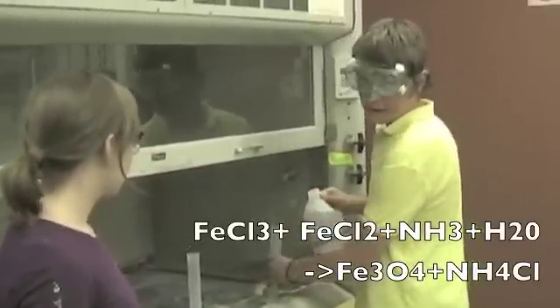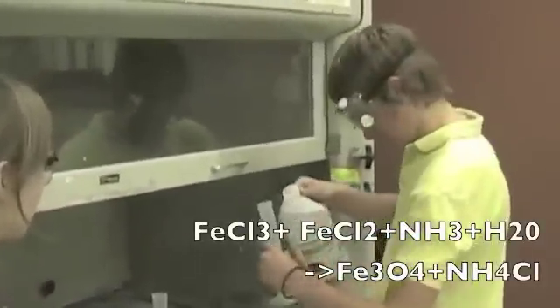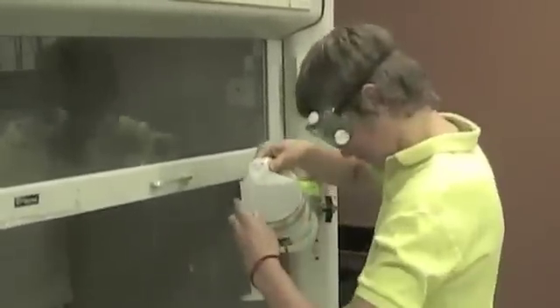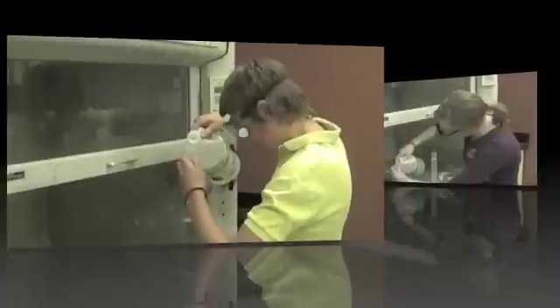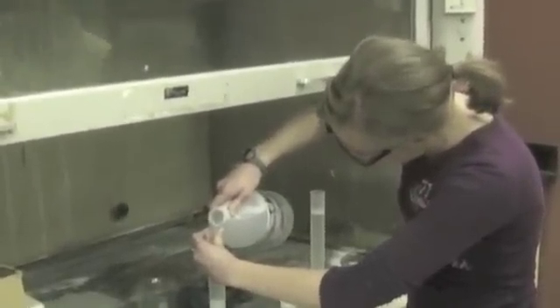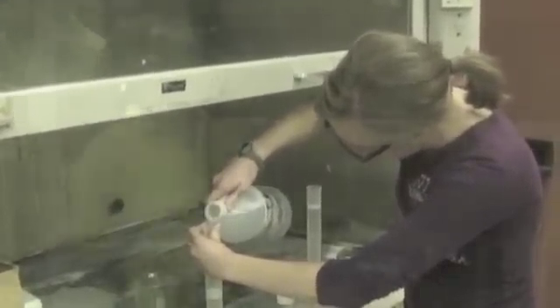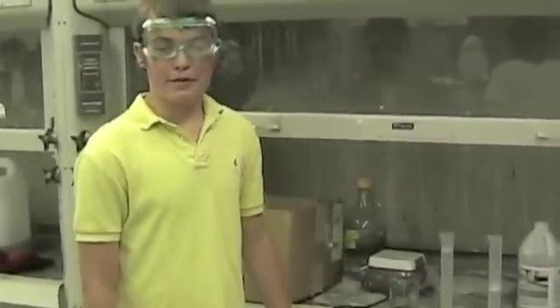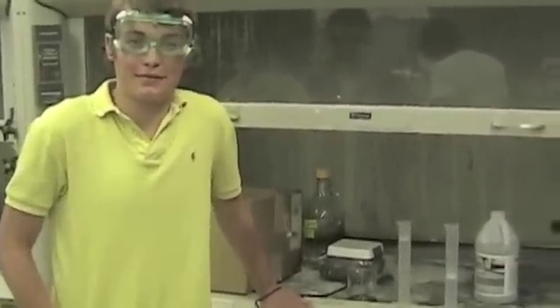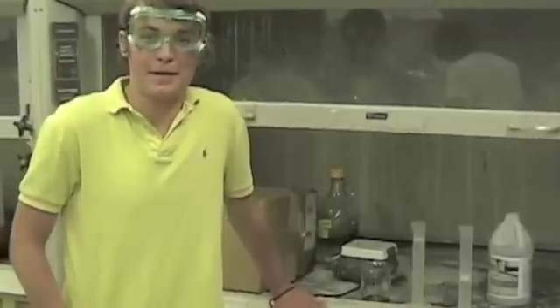Now we're going to take 150 milliliters of ammonia and pour it into the solution to precipitate out the magnetite, which is what we're going to isolate and suspend in the solution.